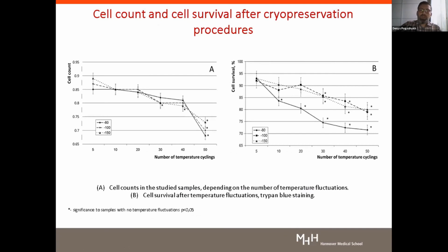Then we thawed the cells, and after each cycle we also thawed part of the cells, and we did a different evaluation of their viability and other parameters.